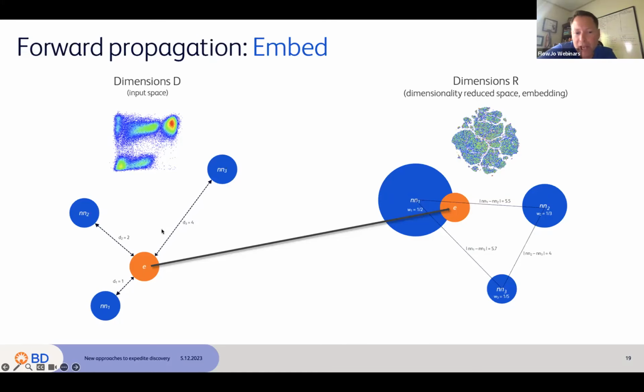And we can also figure out exactly how close. We can weight how important it is. So perhaps NN1 is the one that we weight the most, NN2 the next most, NN3 is the next most after that. You have some tunables in the tool itself to say how many nearest neighbors you want to use. More gives you a more average representation of a cell. Fewer makes the closest neighbor even more important. And so I think we've set 5 as the default now, but we're still playing around with exactly what the best default is. It's something relatively small, something like that.